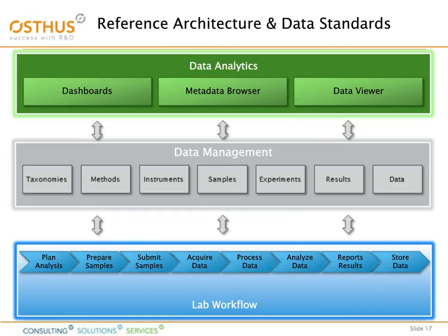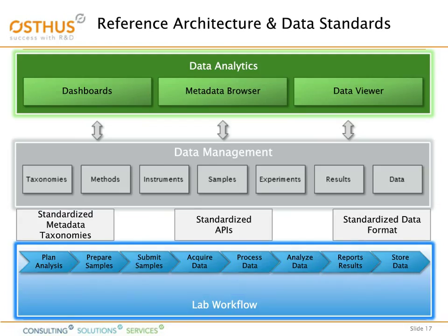So a final, more detailed look at where these standards fit into the workflow. Standardized metadata and taxonomies will allow you to easily exchange the data between systems, as I've already said. It will also ensure that the interpretation of the data is correct. For example, if your registration system, your ELN, and your data analytics systems are all using the same metadata, it makes it much easier to answer the question you want to ask.